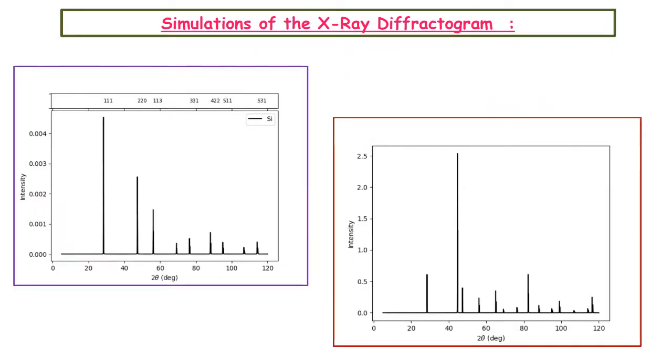Anything else that you can do? Yes. As I said, we as nuclear physicists always like to see simulation. So that's what I asked my colleague Rajesh, who was working on some Fe3SiO2 crystal, how do you know that this is the spectrum you expect? And he said, I just go and take my spectrum and believe in the JCPDS data. That's my Bible. Then we looked back and said, can we actually simulate the XRD spectrum?